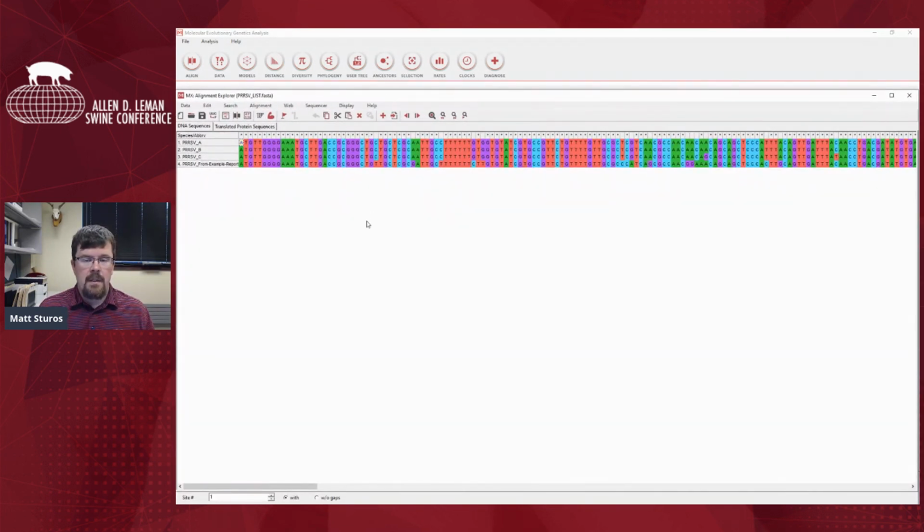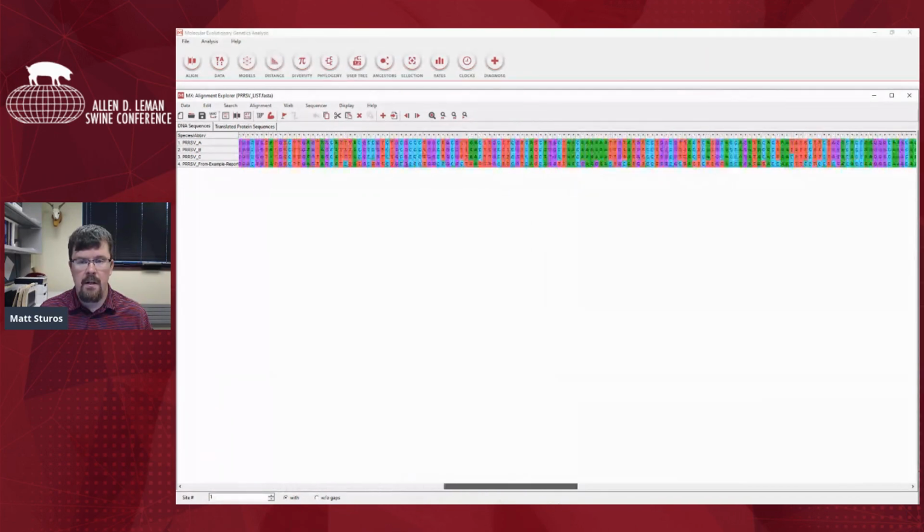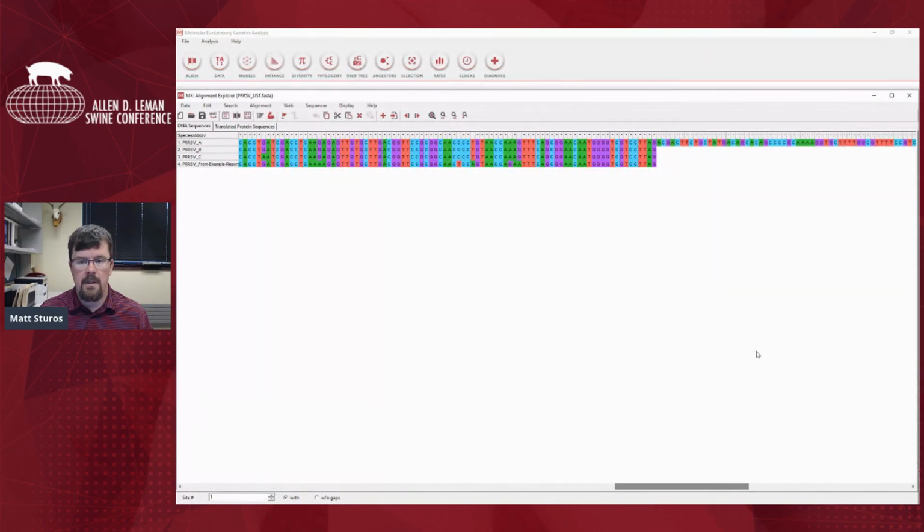And so this is an example of a list. I've got 4 different PERS sequences here, PERS A, B, and C. The colors give you a graphical idea of where something might be the same or different. When you look at this, they all start at 1, and we look down to the far end on the right. Hopefully you're not getting too dizzy.